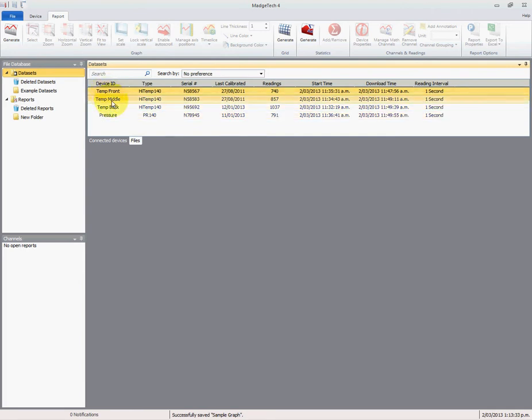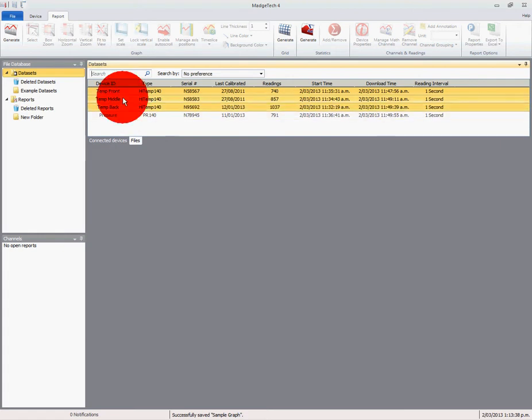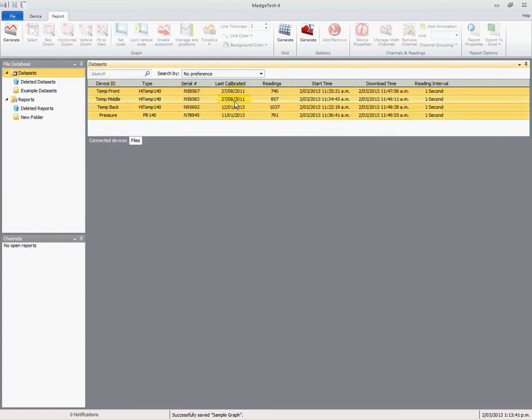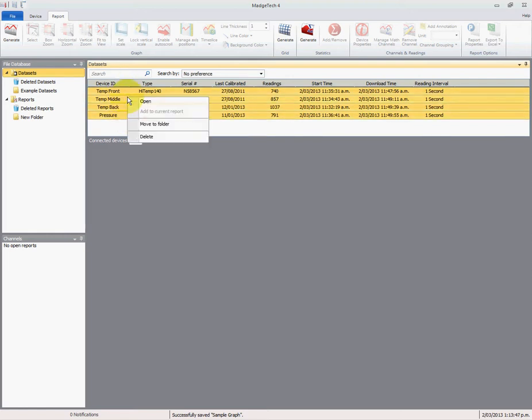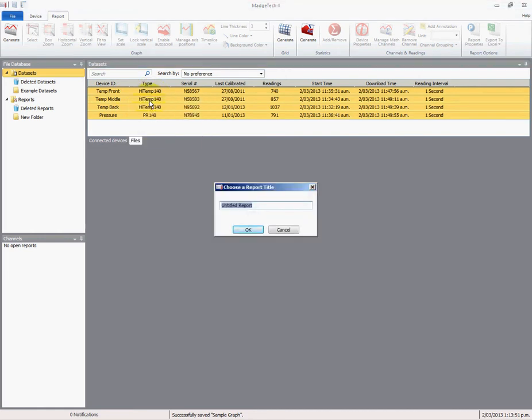If we only wanted to select some of them, we can hold the ctrl key down and select individually or deselect the ones that we want. In this case, I want all four. They're now all highlighted yellow. We'll right-click and select open.